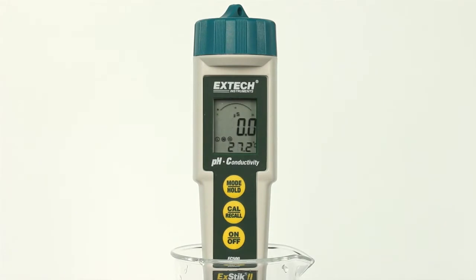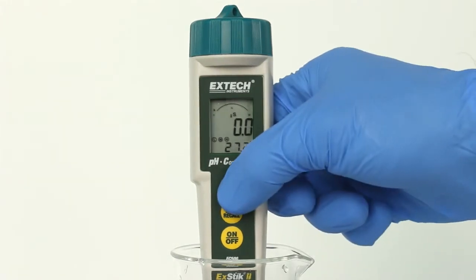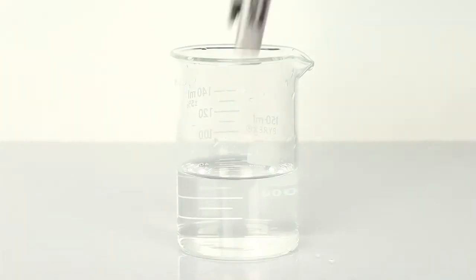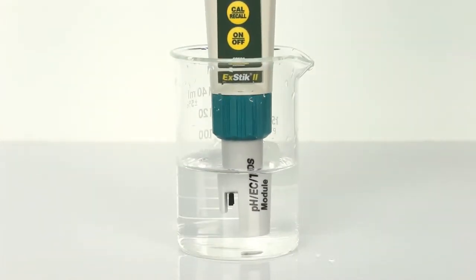Press and hold the mode/hold key to scroll to the desired measurement mode. Insert the electrode into the sample, making sure that the electrodes are completely submersed.